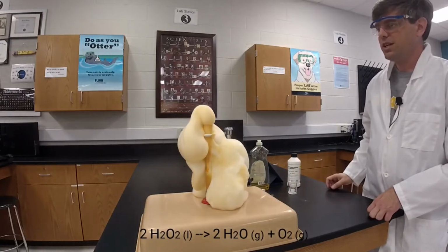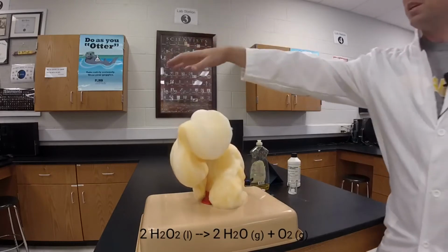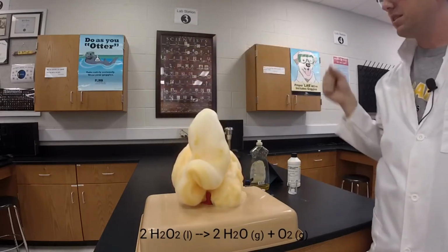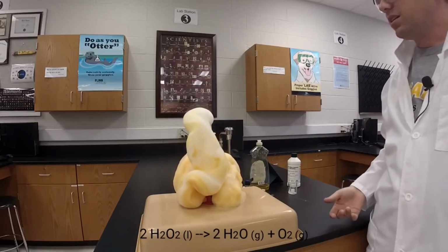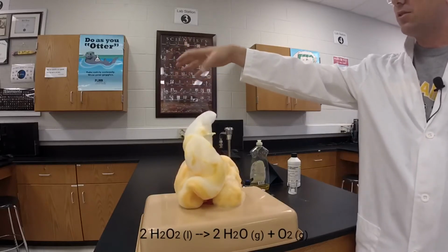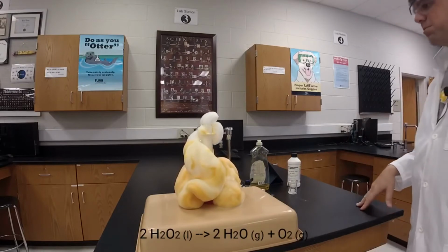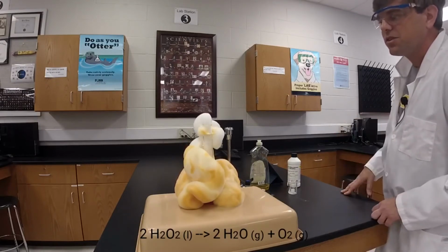As you can see right here. It's giving off a tremendous amount of steam, so this reaction gives off a lot of heat. And it's produced an awful lot of the products of this reaction, which are water, largely in the form of water vapor, and oxygen gas, which is what has produced all of these bubbles. And the reaction's still going there.